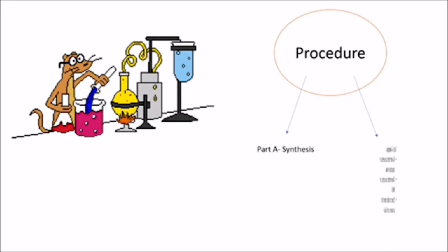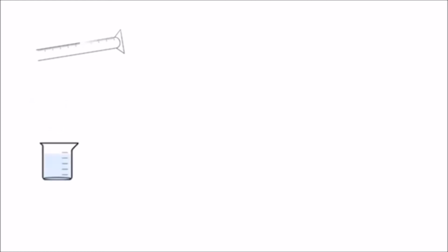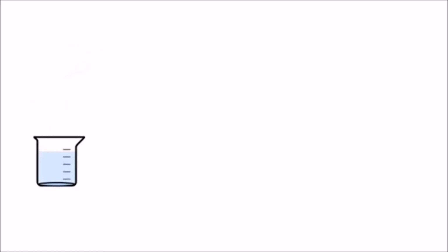10 grams of copper sulfate pentahydrate is placed in a beaker and dissolved with 10 to 15 ml of deionized water, and 20 ml of concentrated NH3 is added. After that, 10 ml of 95% ethanol is added dropwise. Meanwhile, in another beaker, 10 ml of concentrated aqueous NH3 and 15 ml of 90% ethanol are mixed. A watch glass is used to cover the beaker.